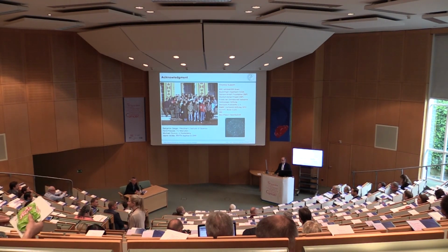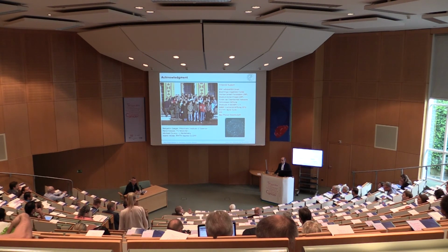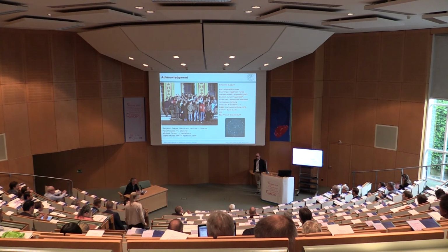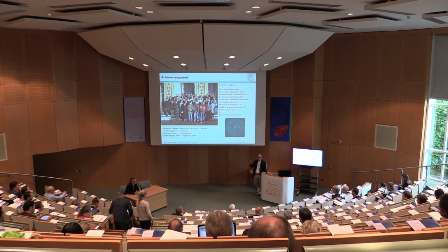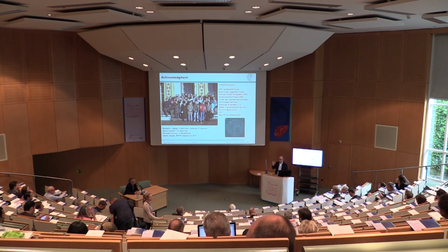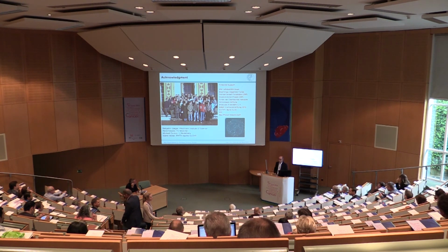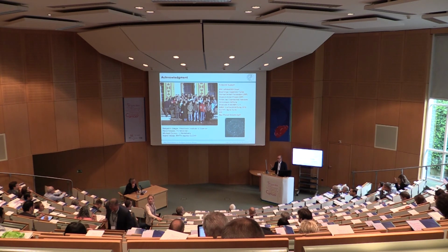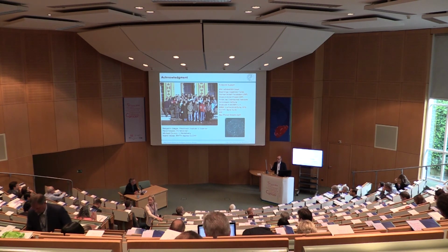Can you do fractal dimension analysis on fixed cells in tissue? Does it have to be free cells? No, it can be fixed. It can also be tissue. It doesn't need to be on a substrate. So in general, I think it's worthwhile to look also really in tissue onto the fractal dimension of cells to get an objective measure of the phenotype at the end.